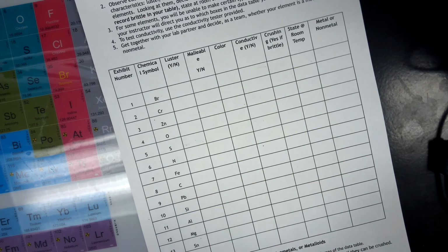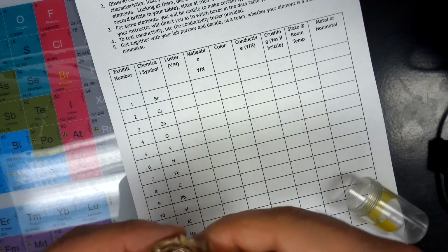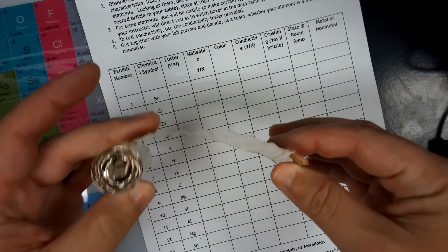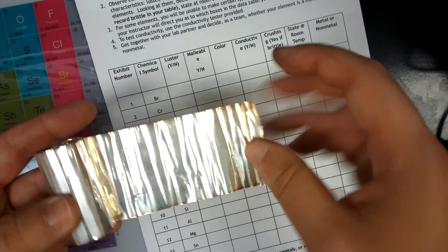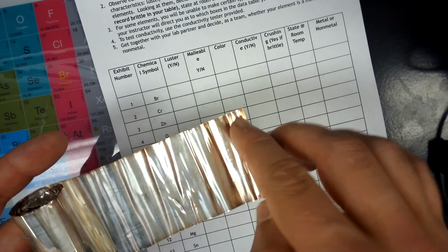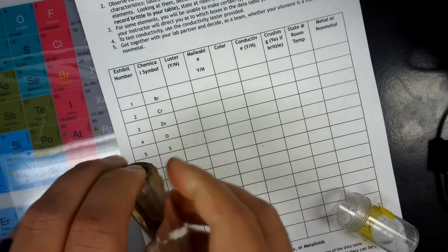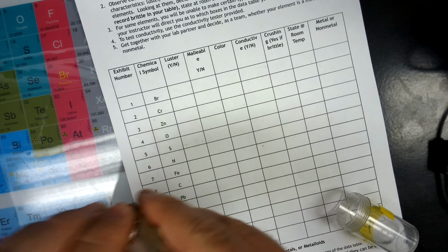And the one that may make you super jelly, we do have one little roll here of actual silver. So obviously we kind of supervise this one because silver, even this small a quantity and in this form, is fairly expensive. But you can see how the edges over the years are getting a little rusted, changing color. And it's just kind of cool to say that you've held some silver. But not this year. COVID throwing a wrench on things.